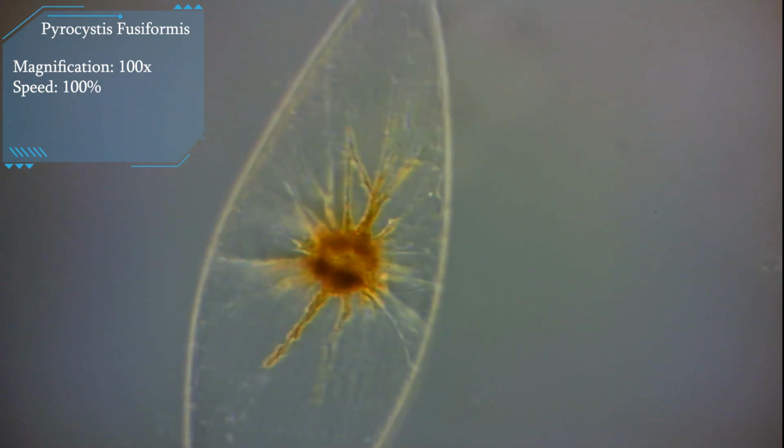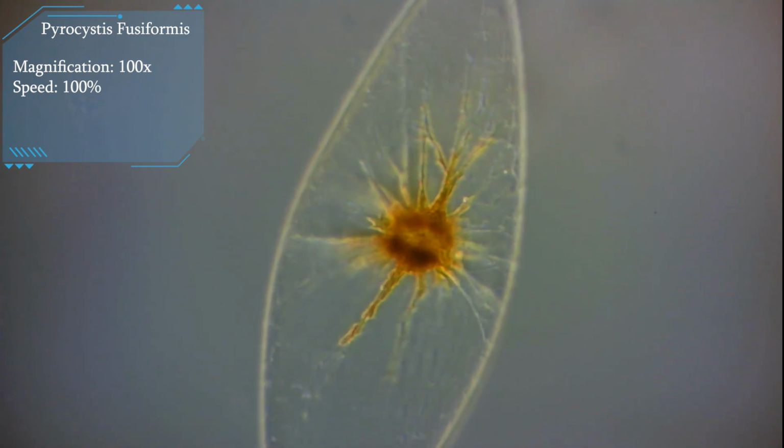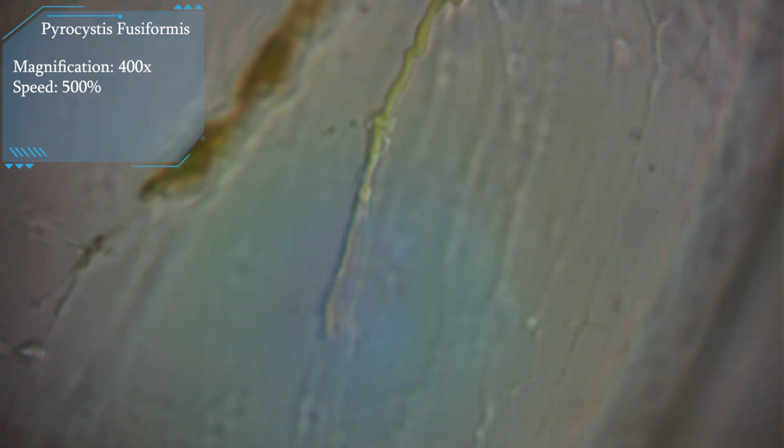and they show their light under mechanical stress. I was trying to turn off the light of the microscope and somehow stress them by touching the cover slide, but it didn't do anything. If you know some methods to make them shine under the microscope, please tell me.